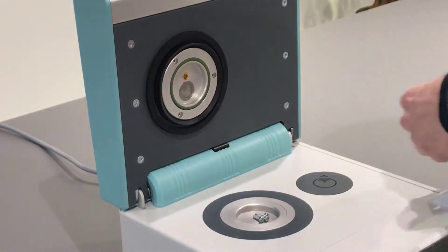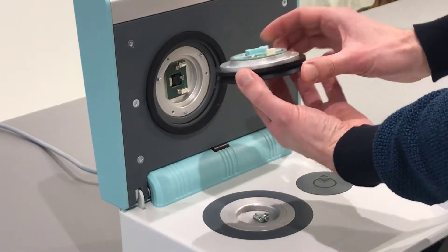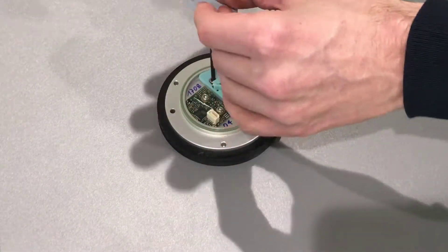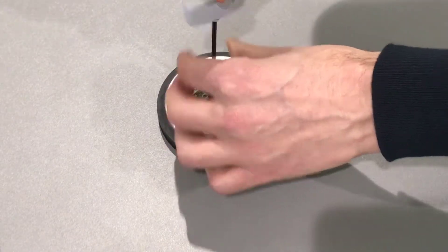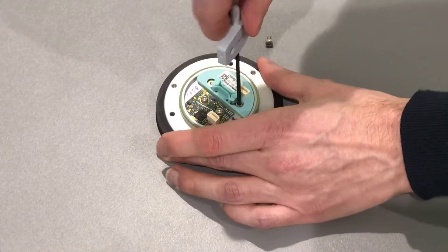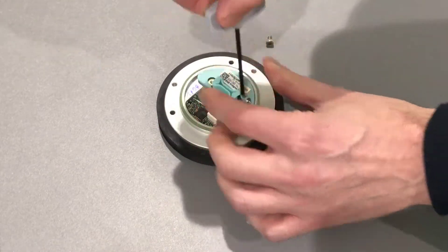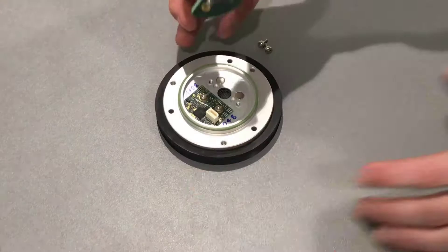Once completed, remove the measurement head by pulling on the black gasket as shown in the movie. The sensor is located at the back of the measurement head. Place the measurement head on a table so that you can access the two screws which fix the sensor in place. Use the L&K to dismount the screws. Then pull out the sensor by holding the small bar which is located on the sensor itself.